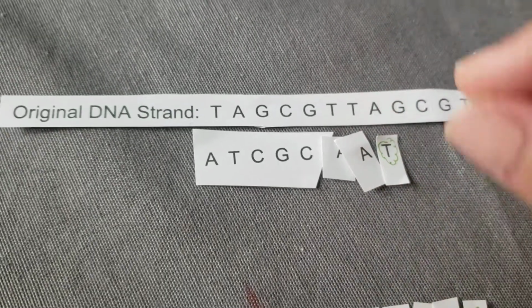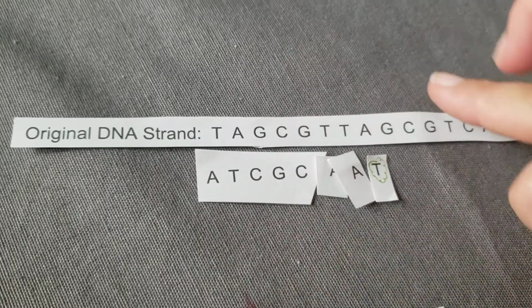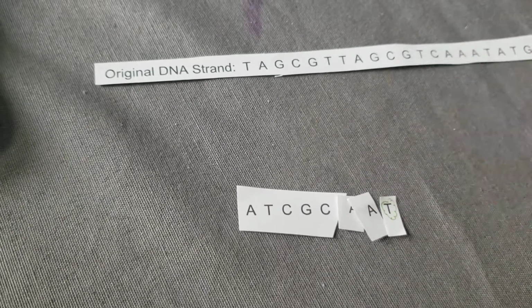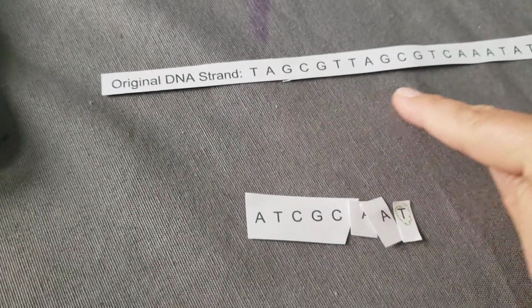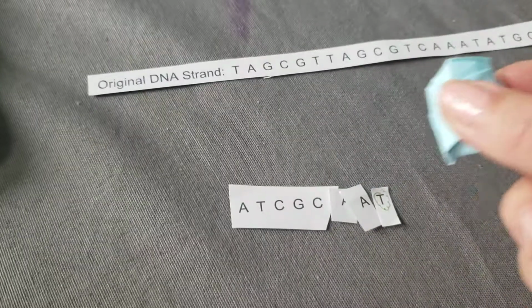And then it will go through the process of heating the sample. These two strands of DNA will become separated, and we're going to start to see that yet again, primers attach, the nucleotides are going to be added in place by the polymerase doing its job, and so on and so forth.